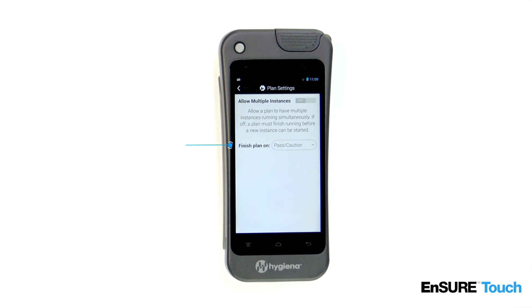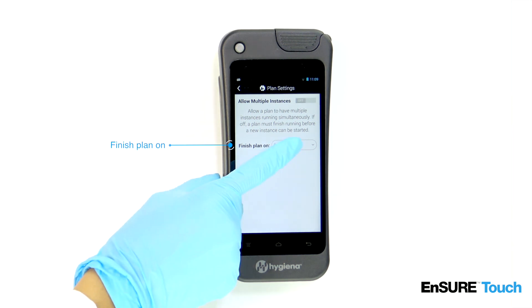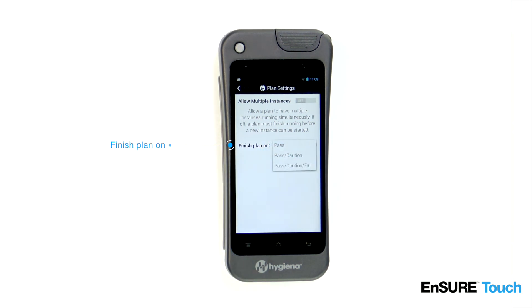Finish Plan allows you to specify the Pass, Caution, or Fail level at which a plan will automatically finish. The default option is Pass/Caution, which means that a plan will automatically finish if the test results are Pass or Caution.